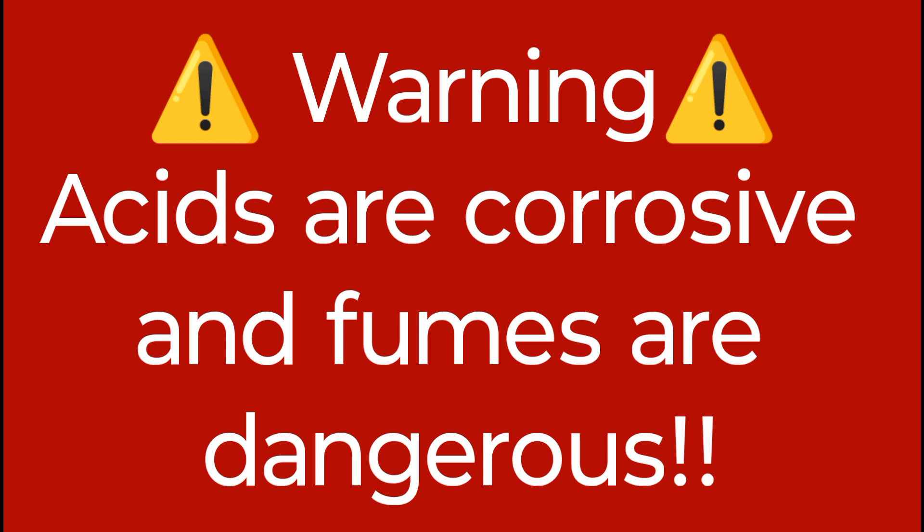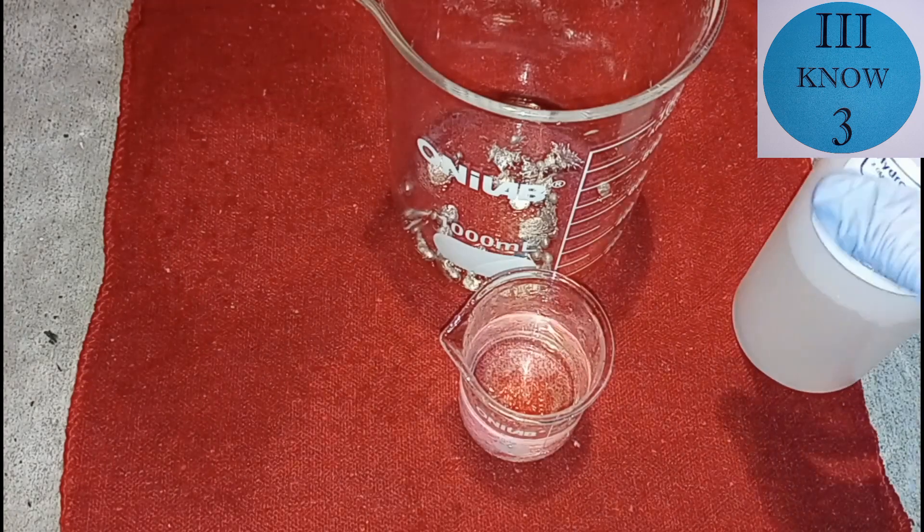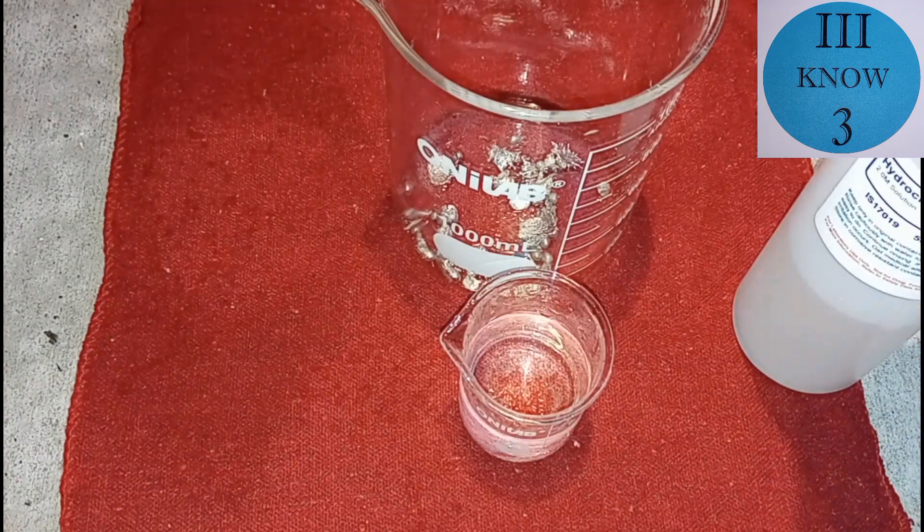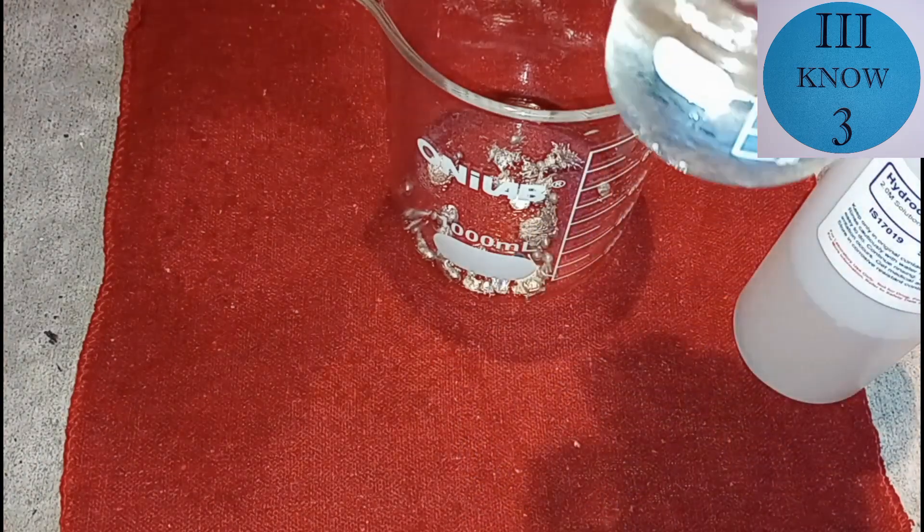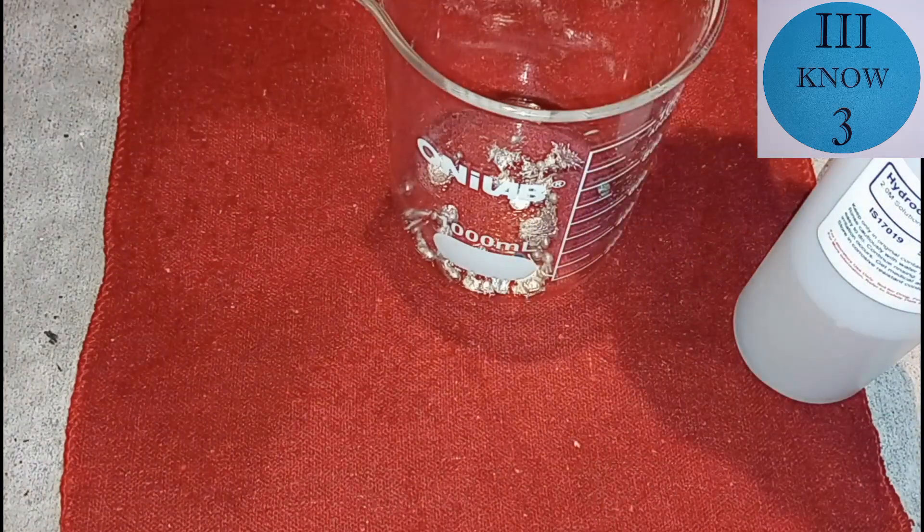Warning, the acids that I'll be working with are highly corrosive and their fumes are dangerous. Protect yourself. So we're going to start off by trying to dissolve this tin shot in hydrochloric acid. This is a 2 molar solution of hydrochloric acid and we're going to start off with about 80 milliliters.